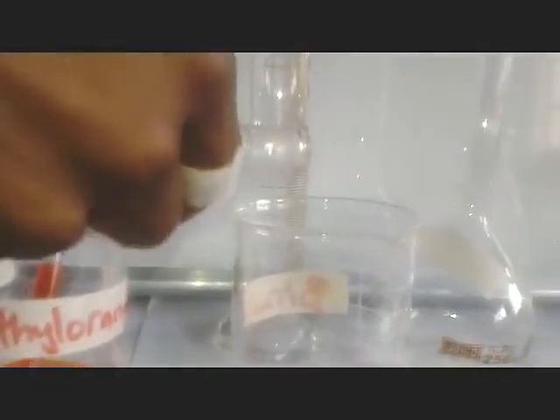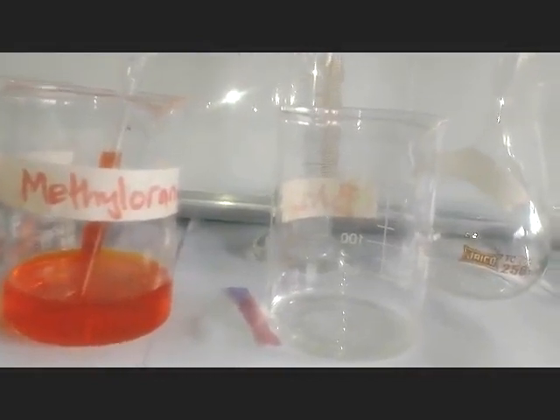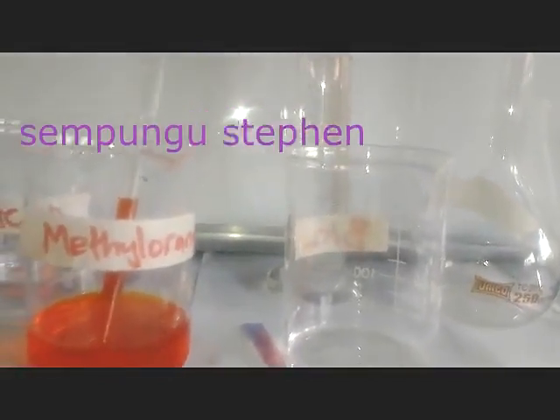This is my base. I'm going to put here my base. So let me put some little base there. That is my base. What can prove that it is a base, I've already told you that method. You can prove by using our blue litmus paper. Putting blue litmus paper in a base, it is going to remain blue. You know that one.